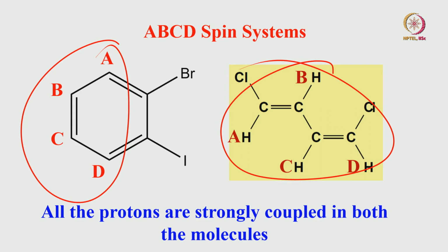So, you can ask me a question: what happens if there is chemical equivalence, what happens if there is magnetic equivalence, what happens if there are groups of peaks like a CH2 or CH3 group, how do you put the nomenclature for that, how does that NMR spectrum come? There is a way to understand. There is a nomenclature for that also. We will come to that later, that is an extensive discussion, but at the moment the time is getting over, I am going to stop here.